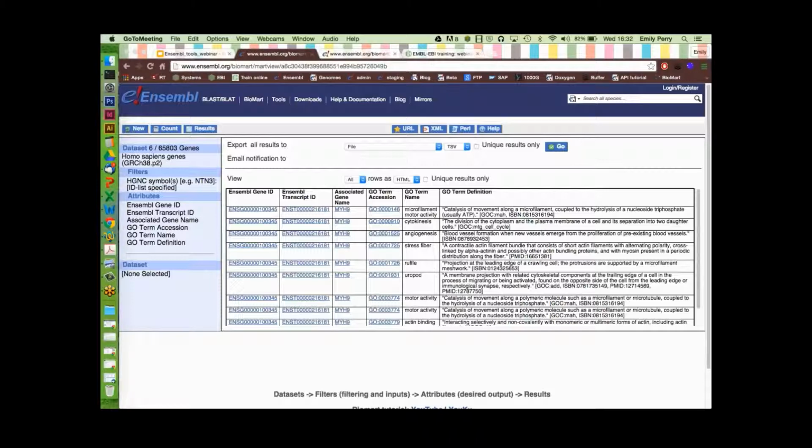We've got another question about BLAST and BLAT. We can use both BLAST and BLAT for genome and protein sequences. I think protein sequences have to be BLAST, and there are particular BLAST tools which are suited to and designed for protein sequences. BLAT and BLAST can be used for genome queries.